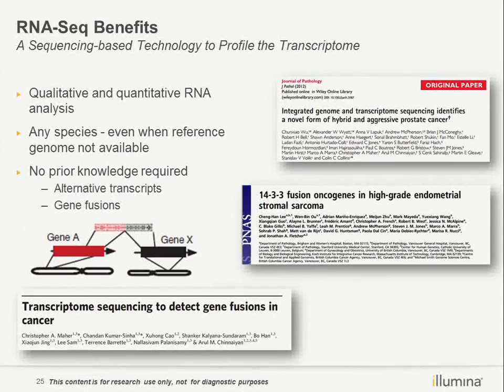These proteins will drive maybe some cellular dysfunction. But we can only see there is some level of randomness in the occurrence of this gene fusion. By using RNA sequencing, we can sequence this special locus where the gene fusion may occur. And this way we will know whether some gene fusion exists or not.